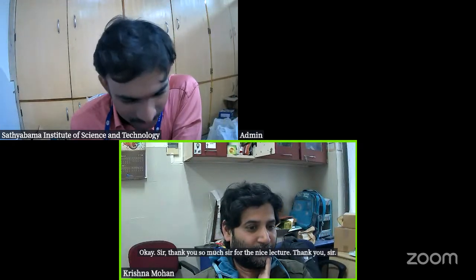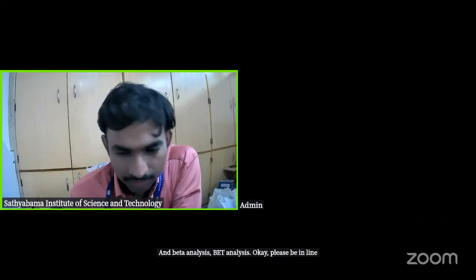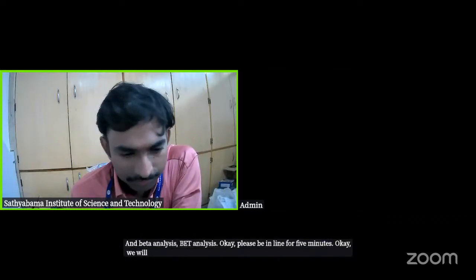Okay, participants, now the demo on the pycnometer and BET analysis. Please be in line for 5 minutes. We will connect you. We'll get back to you.